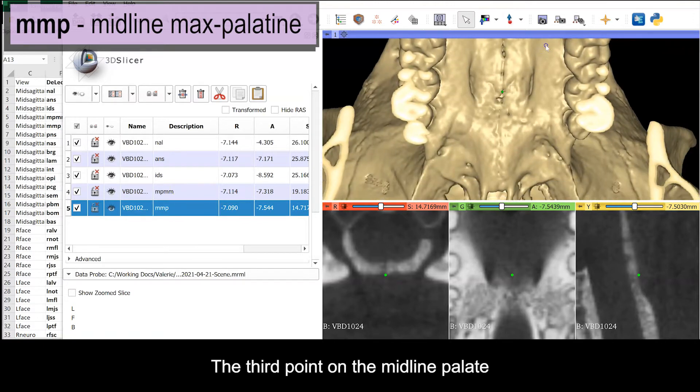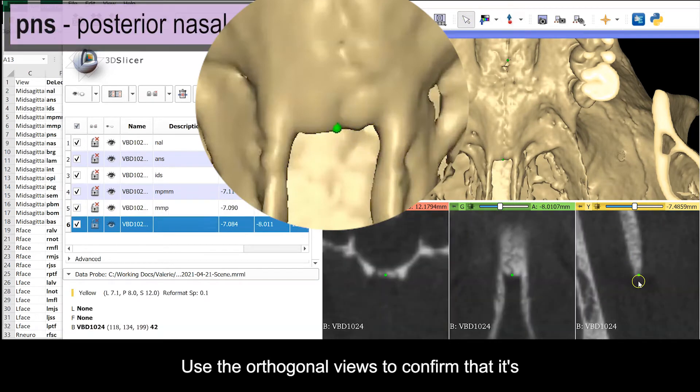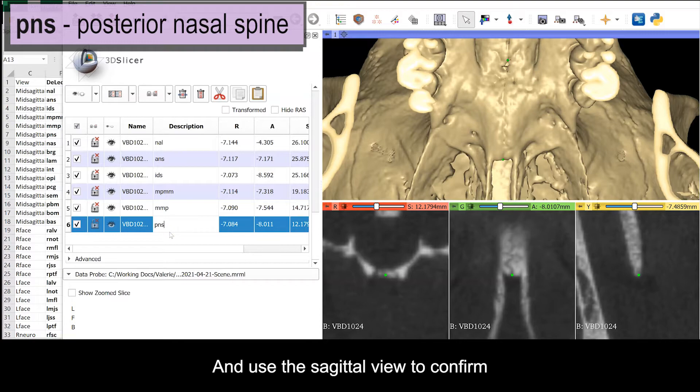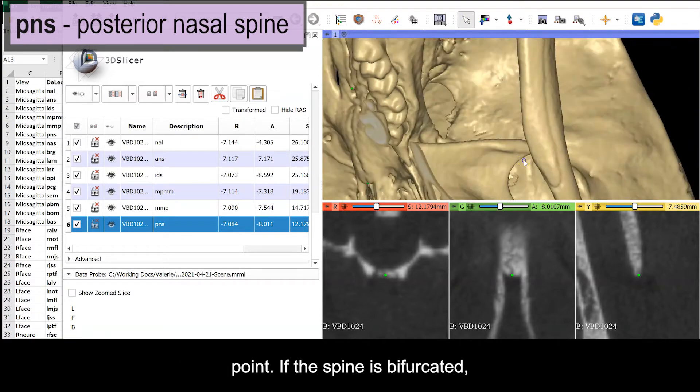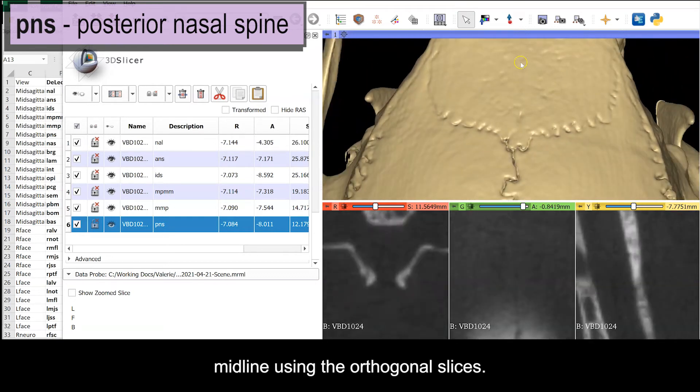The third point on the midline palate is the posterior nasal spine. Use your orthogonal views to confirm that it's placed on the mid-palatal suture and use the sagittal view to confirm that it's placed on the most posterior or caudal point. If the spine is bifurcated, you'll need to project it to the midline using the orthogonal slices.